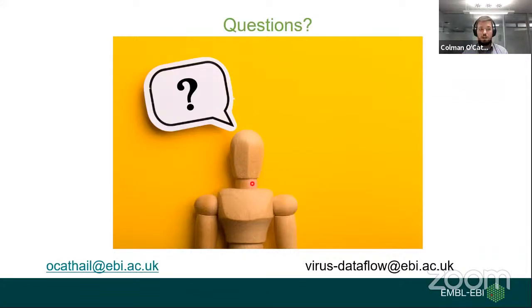Yeah, we are rerunning it daily. Okay, so then you always use whatever the latest Pangolin database of the time is. Yeah, exactly. So Pangolin should get updated in the morning if there's a new release of their version, and then we run it, I think, a couple of hours later on all the data. So there might be a slight lag behind in terms of the presentation, because it's a day or two before you catch up on whatever the previous release was. But yeah, it's a daily update.